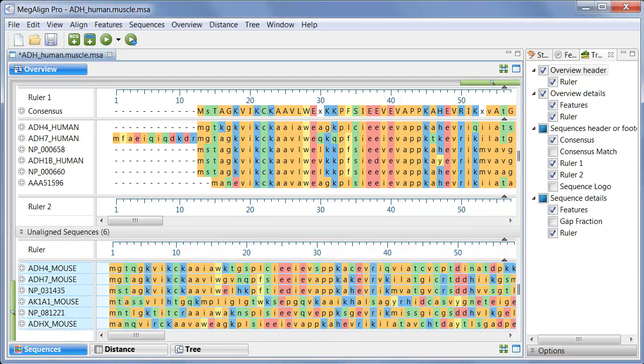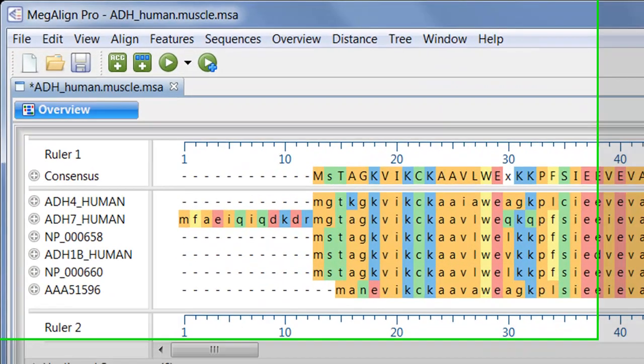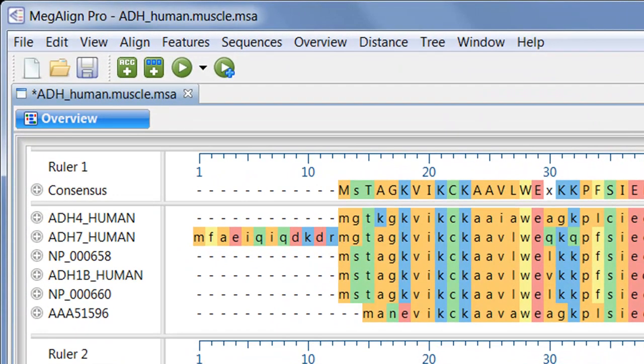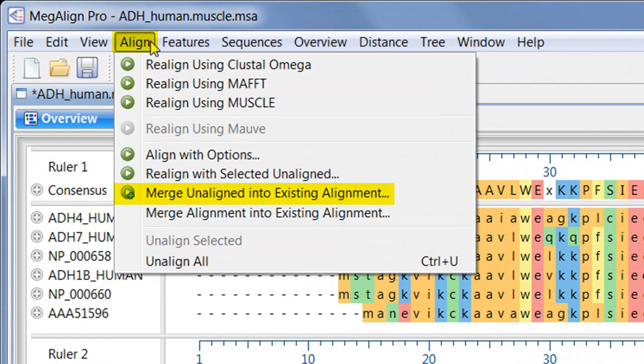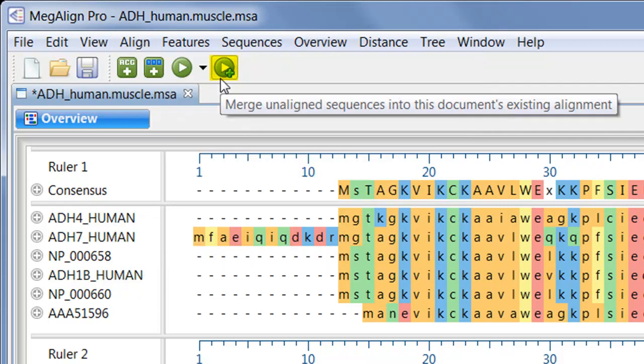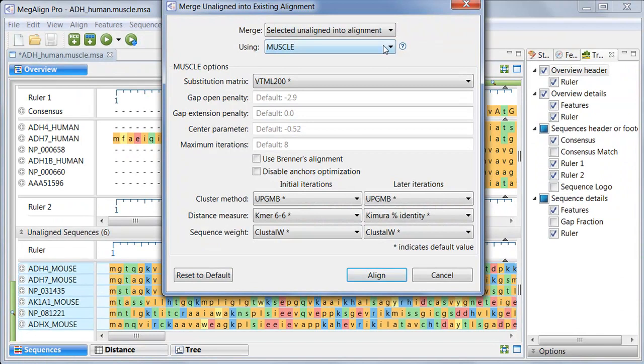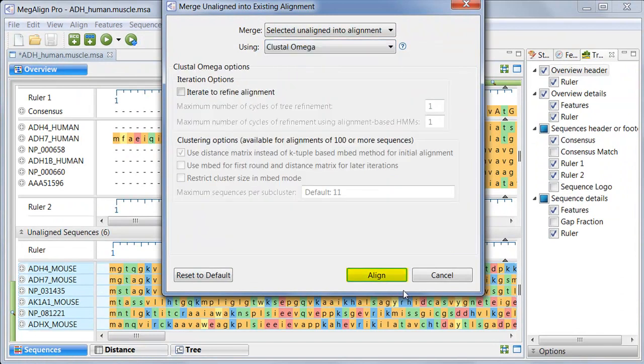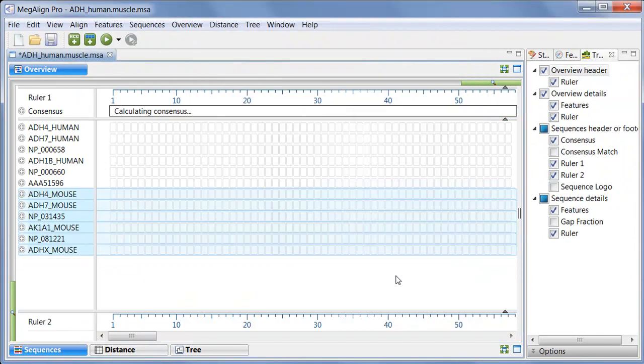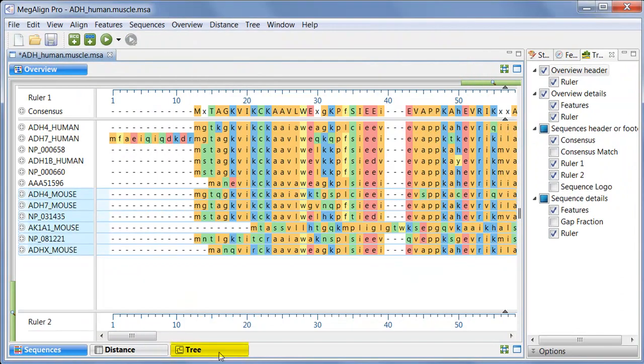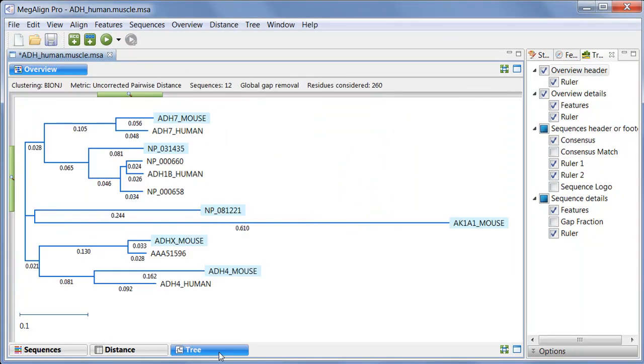To merge the unaligned sequences into the existing alignment, I can either choose Align, Merge Unaligned into existing alignment from the menu, or I can press the corresponding tool. Again, I'll choose Clustal Omega, and click Align. And here's the phylogenetic tree resulting from this second type of profile alignment.